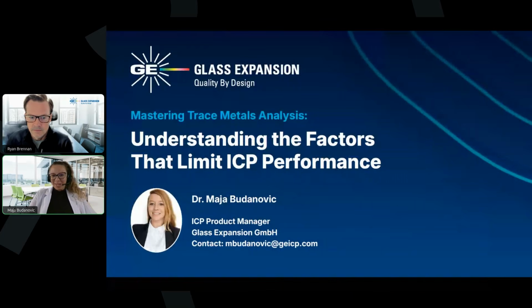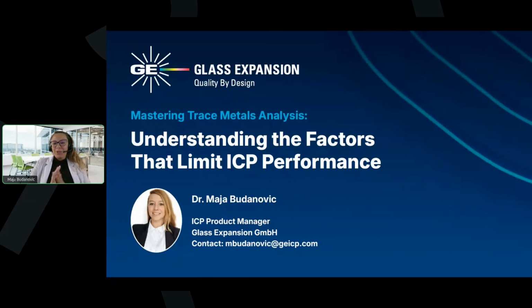Well, thank you, Ryan, for the introduction, and thank you, everyone, for joining us. As Ryan said, today we will be discussing some of the key factors that can influence your ICP performance. Many of the challenges we see in the lab are not necessarily related to the instrument itself. Very often, they are influenced by small details in your sample introduction system, from how the sample is delivered to how efficiently it reaches the plasma.